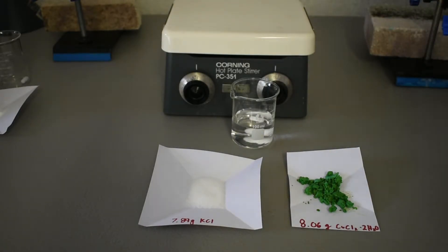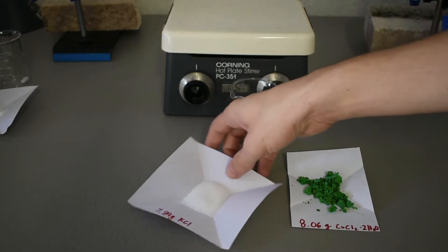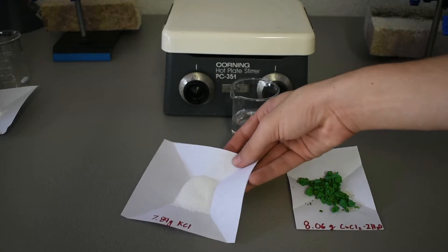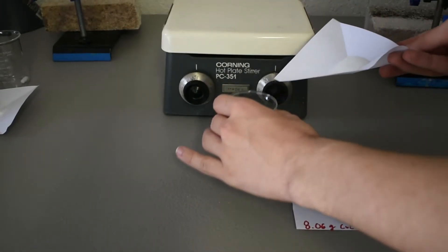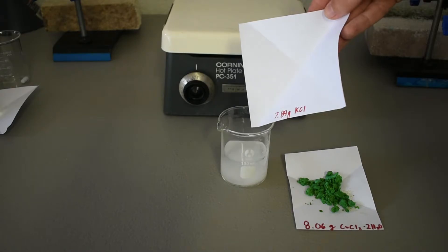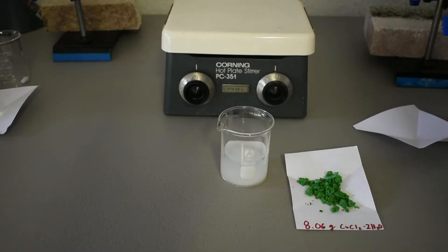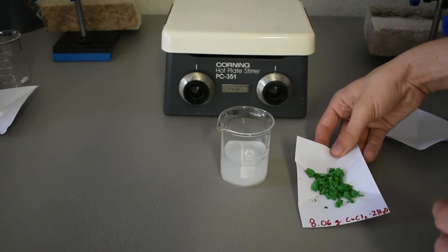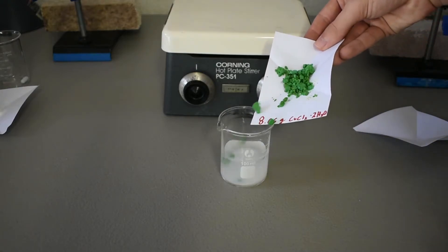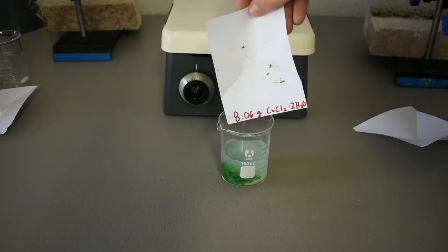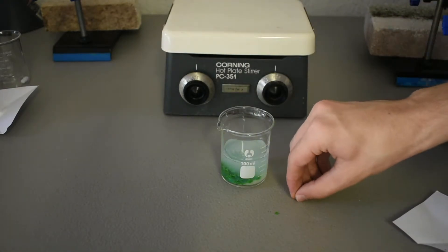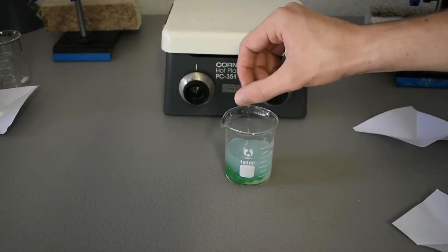So I'm going to get some water. Add about 50 milliliters, and then I'm going to add our salts. So in goes the potassium chloride. There we go. And then our copper chloride. And then I'll get this stirring.